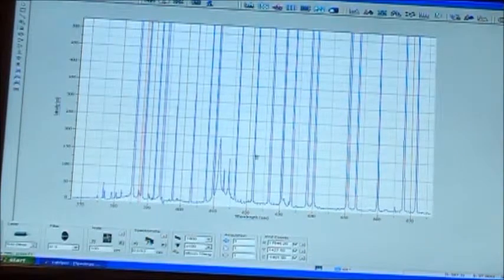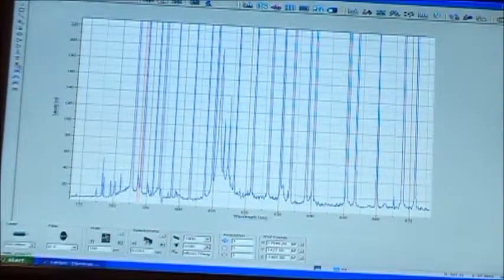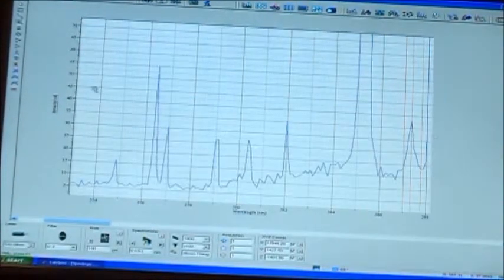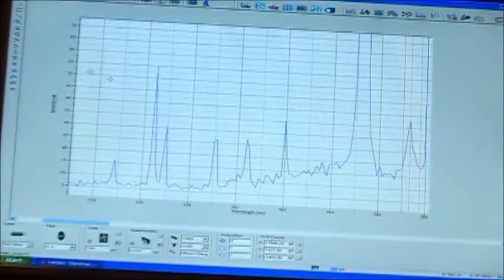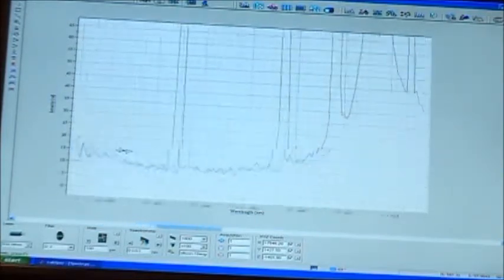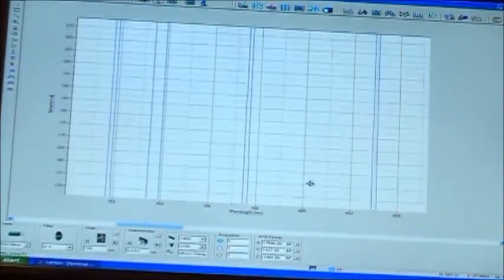But if you're zoomed all the way up and you want to see some data that is off to the side, because for example you are zoomed in somewhere and you want to see data that is to the right, the next one down is a scale shift. You can move your scale left, right, scroll down it, scroll up it, scroll your scale in any direction that you want to see what is there.